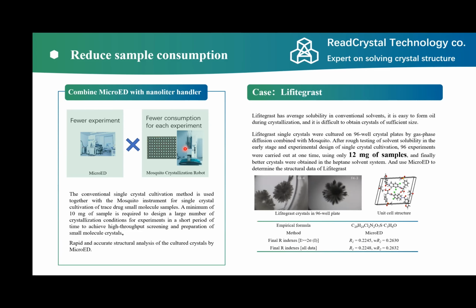This robot is like a nanoliter liquid handler. With this robot, we can lower the consumption of each experiment significantly. We can handle nanoliter solvent, and each experiment consumes only, for example, micrograms of sample.